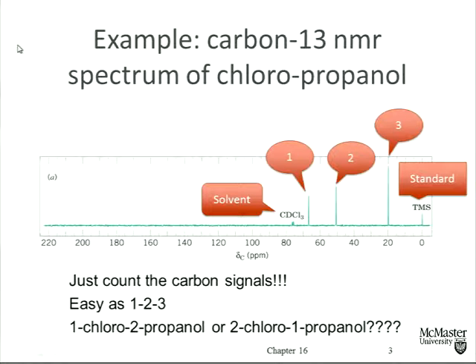And we do that just so that the axis is the same, no matter what particular type of NMR spectrometer that we use. It runs in a normal carbon NMR from about 0 to about 200 or 220 parts per million. Every carbon NMR spectrum runs over the same range. All the different carbon nuclei in a molecule, or in most common molecules, lie in this range. Very few in negative numbers, very few above 220 parts per million. So this is just an axis. It's got numbers on it. Don't worry about the numbers.